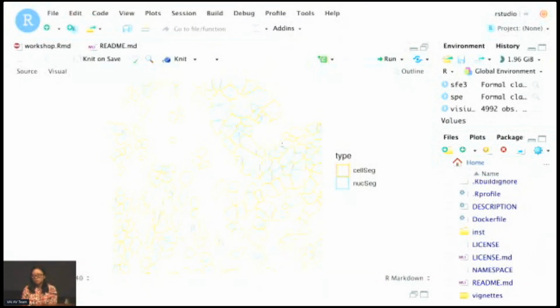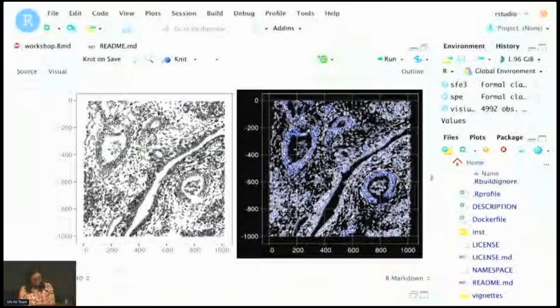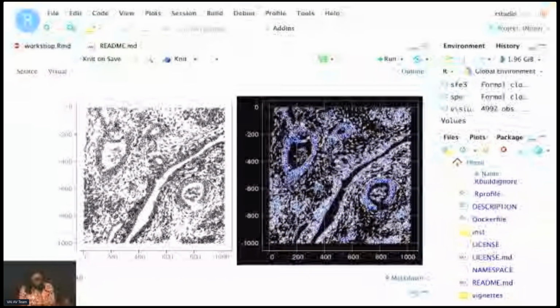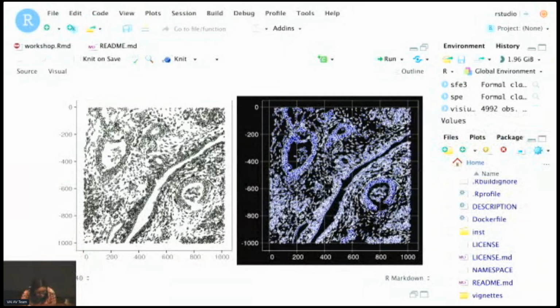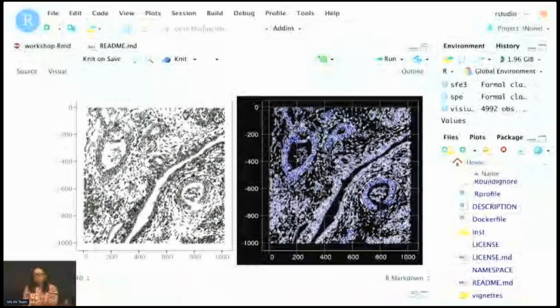If you go back to the dark background plot, you have a white boundary, the inside of each cell is dark blue, and it seems to have white boundaries for each cell, is it? Yeah. So the white boundary gives a white shade to the blue on top of it. It sometimes works, it sometimes doesn't, but I'm just curious if you have experienced that.